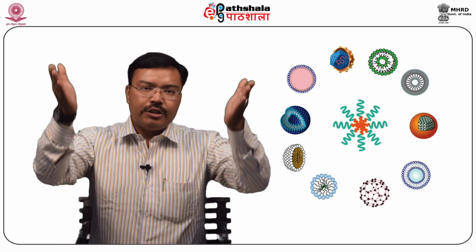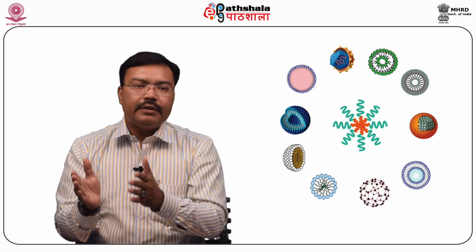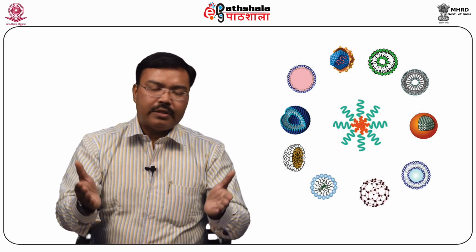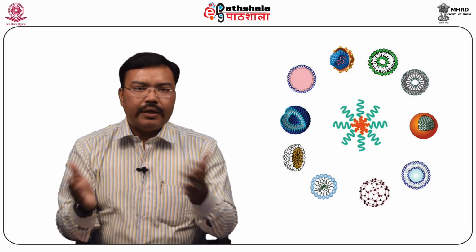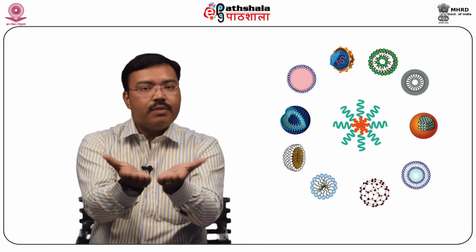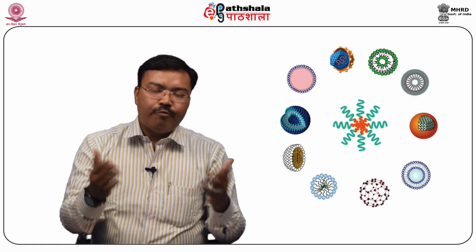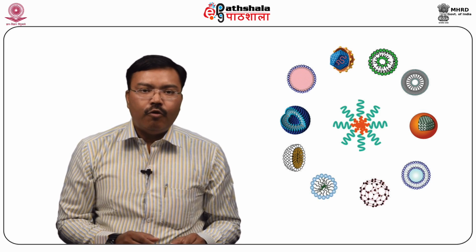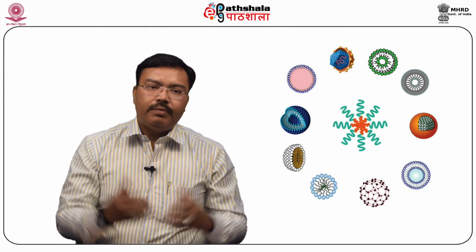Now we have a division of light into undeviated and diffracted light, which are retarded in phase by structures and phase gradients present in the specimen. The undeviated and diffracted light is collected by the objective, which is placed just above the specimen sample, and is segregated at the rear focal plane by a phase plate, then focused at the intermediate image plane to form the final phase contrast image, which is observed in the eyepiece.